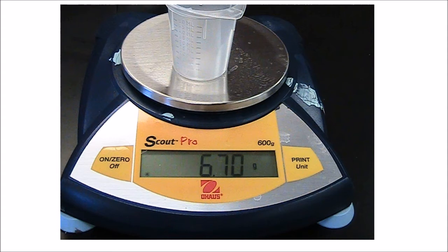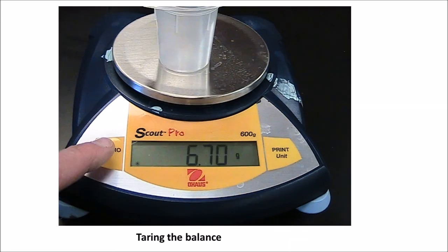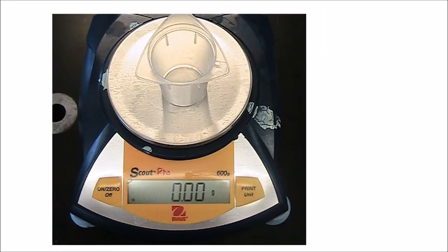Now I could write down the mass of the beaker and subtract it out every time, but the other thing I can do is use this button here that says on, 0, and off to tare the balance. Taring, T-A-R-I-N-G, or if I want to tare the balance, T-A-R-E. When I hit that button, the screen will come up with this beaker on it and say 0. So the beaker's on here, it's reading 0, and anything I add will just show the mass of that object in our window here.